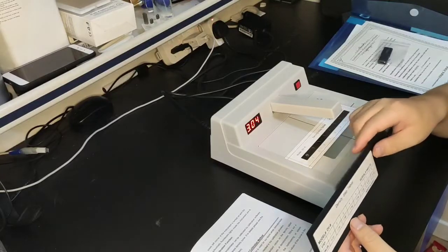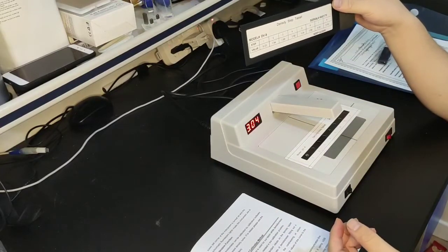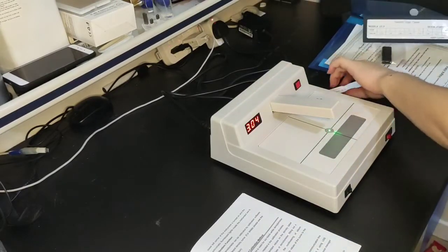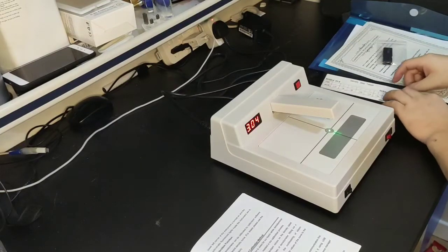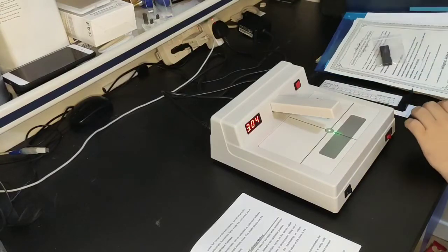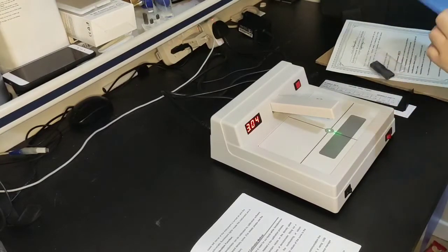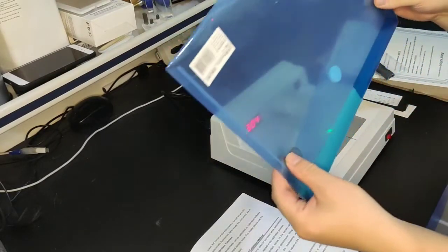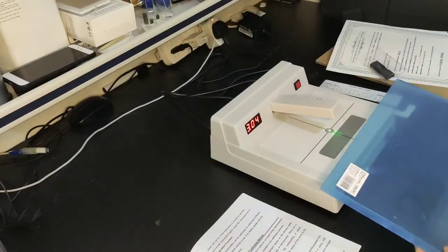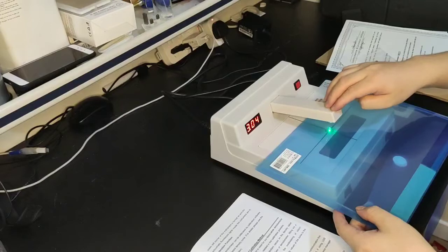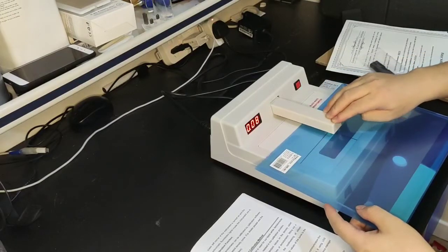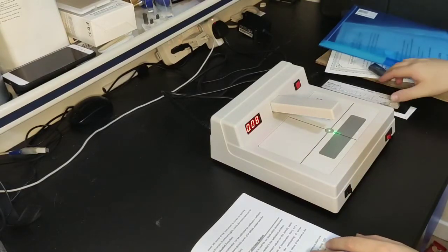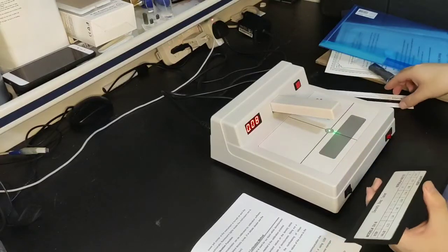If we have other films, maybe we can put some other films. Let me check. Maybe we use this one. This is a document holder. We can use this one, no problem, as long as it's transparent. It has some color, so we can also test this density. We just press down, release. It is 0.08, the density. So this is how we use this machine.